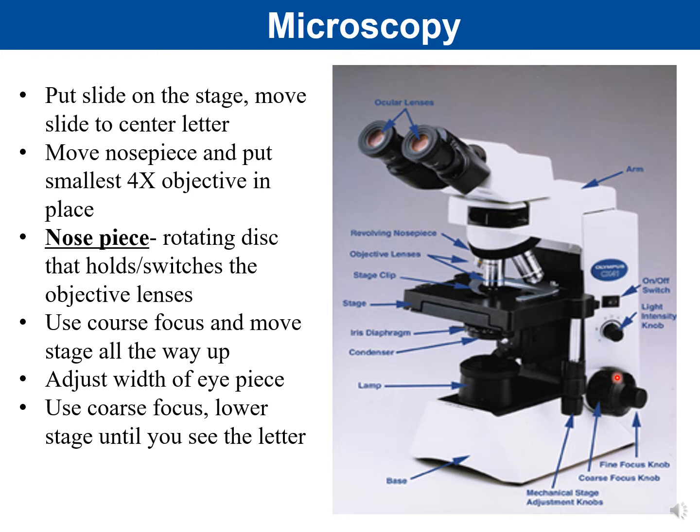Stop with the coarse focus, and then you would use the fine focus. The fine focus is going to make smaller movements to the stage. And again, it's going to allow you to fine tune your image. So use your fine focus to get it into focus so that you can see it clearly.